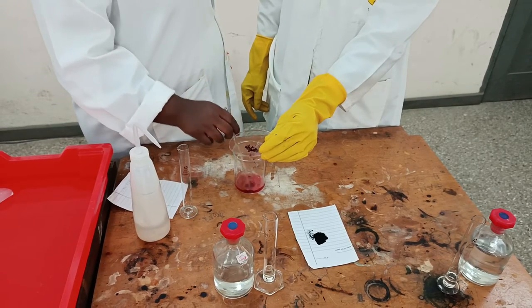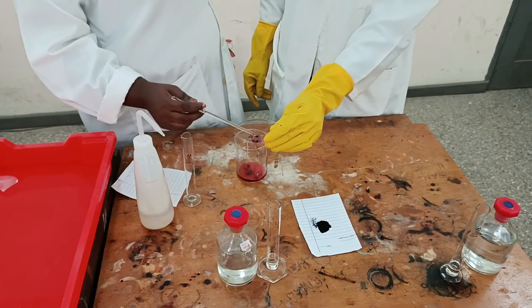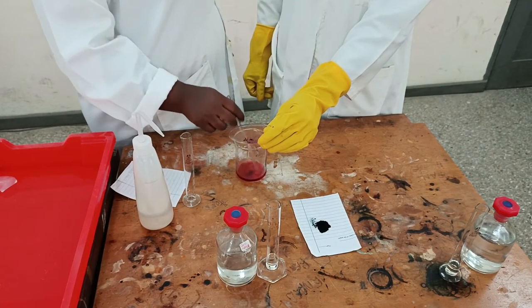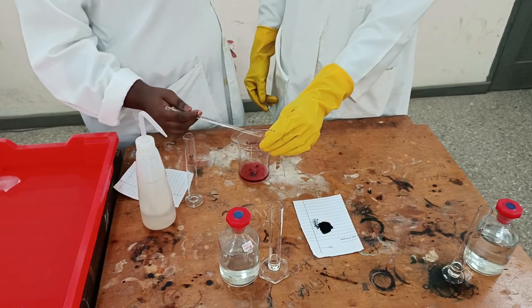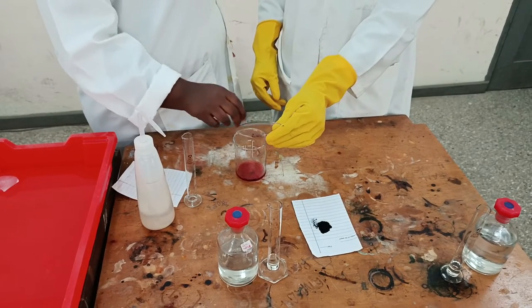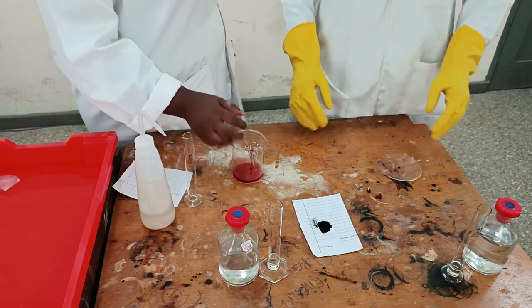This is the part I enjoy doing. Gradually. Gradually. So why do you have to add this gradually? Wonderful. To avoid the splashing or wasting of it, you add it gradually, then you stir. Okay. All right. Are you going to wash this part with water? Let's leave it like that. Okay. All right. So we stir till everything dissolves completely.